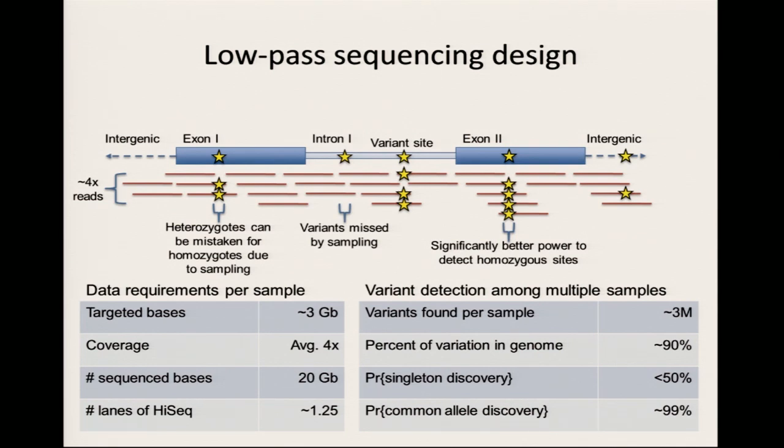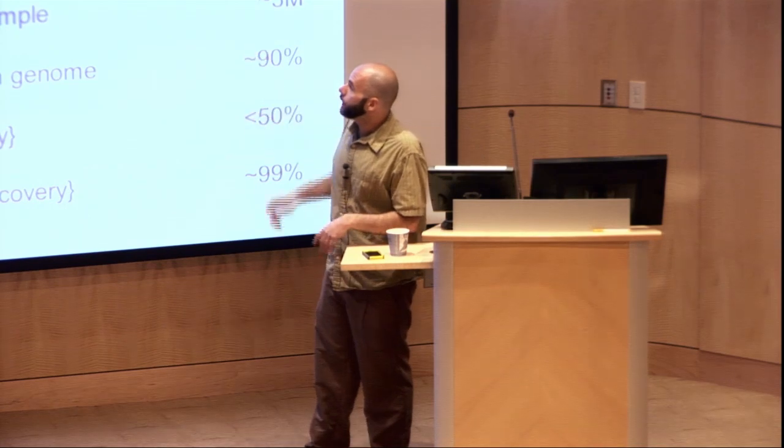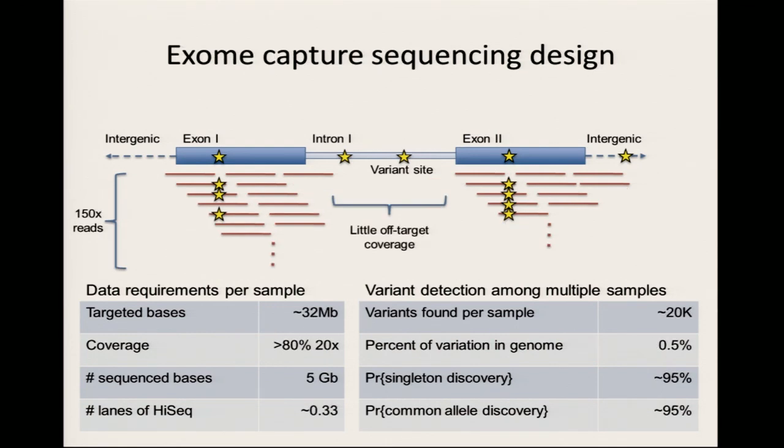You know, with 4 reads, maybe you just accidentally, the read with the variant didn't show up, right? So that's happening in the middle here. So it was covered by 3 reads, and it was a heterozygous SNP, so that the read with the variant just never showed up due to random sampling. And so you missed it. It was gone. That's basically it.